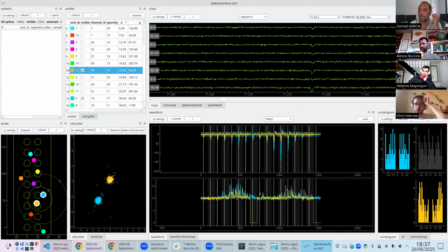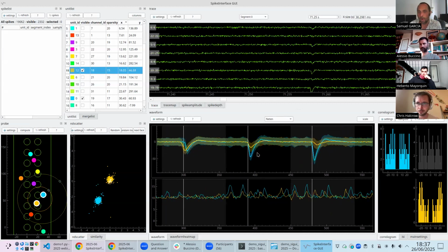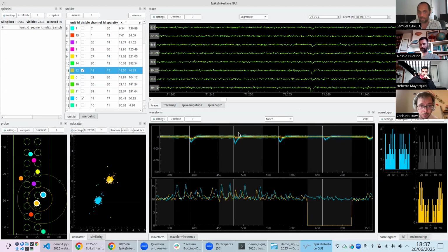You should look very closely at the standard deviation, in short, to check that you don't have bumps, that your standard deviation is flat enough. It's a really important criterion for the quality of your sorting. So you can switch to this or this. I prefer this, it depends.